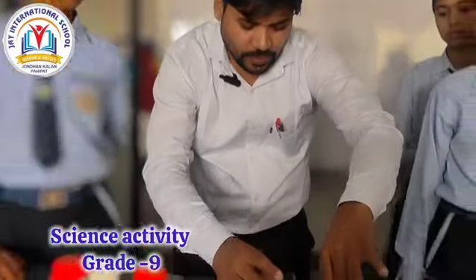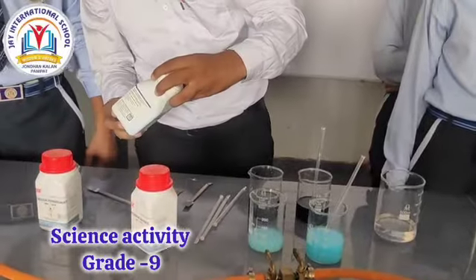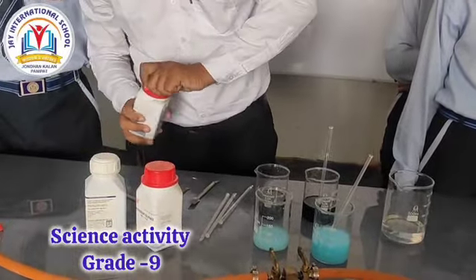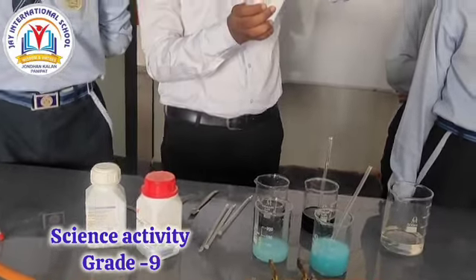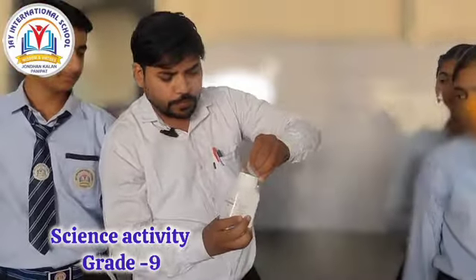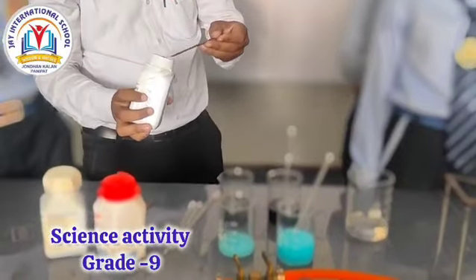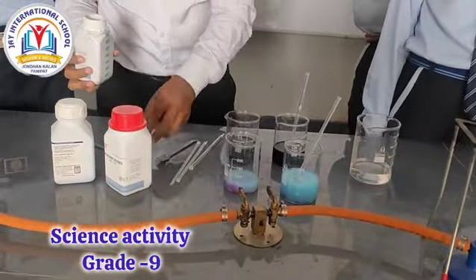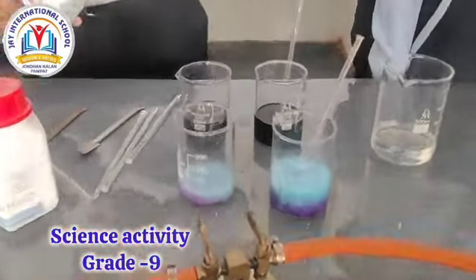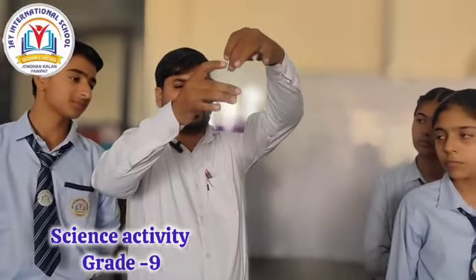Okay. So now I add some particles or crystals of potassium permanganate to the last 2 beakers with the help of a spatula. By stirring with the glass rod, what is the color of this?